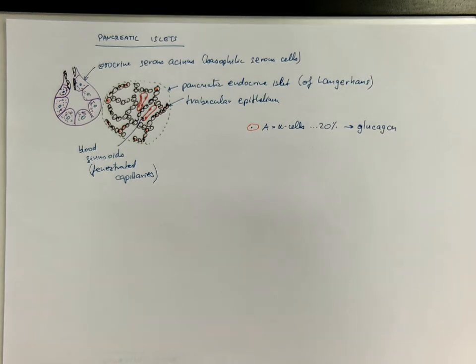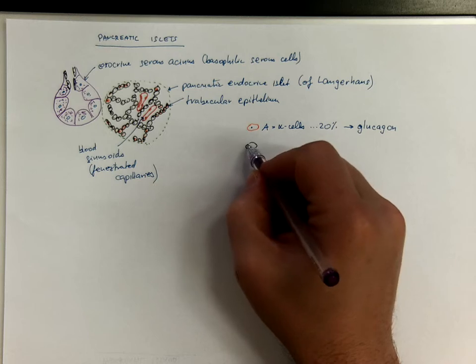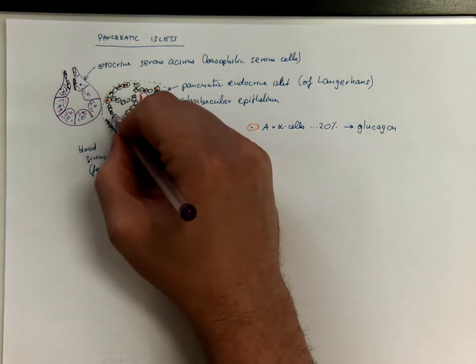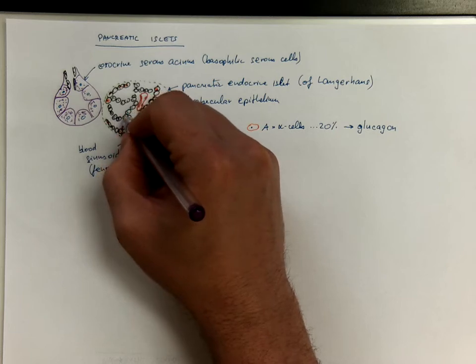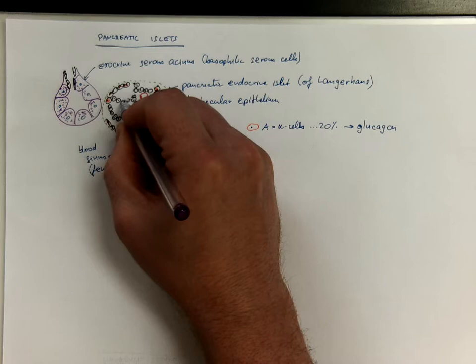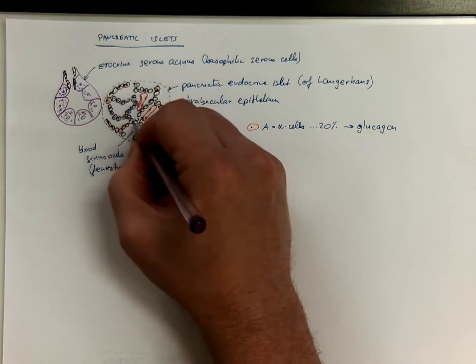The most numerous are the B cells. These are just artificial colors, okay? Just not the real colors in the real slide. The B cells occupy mostly the center of the islet.